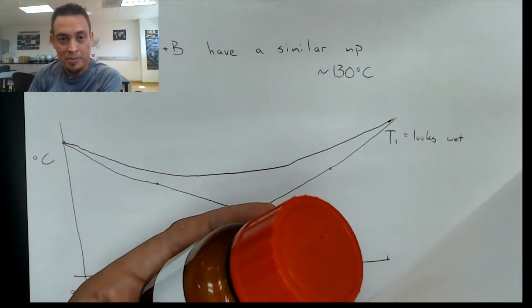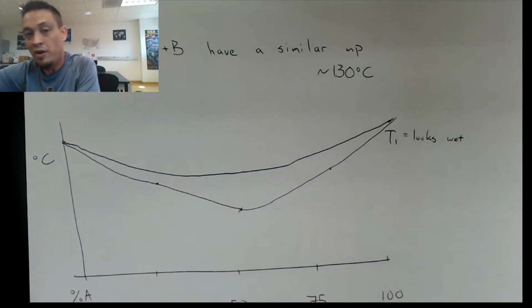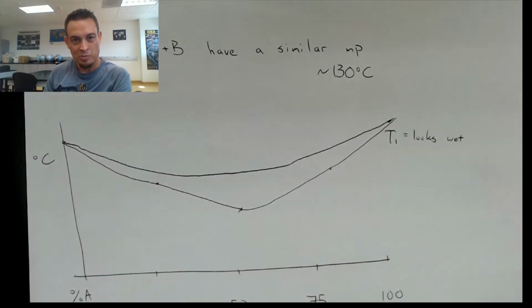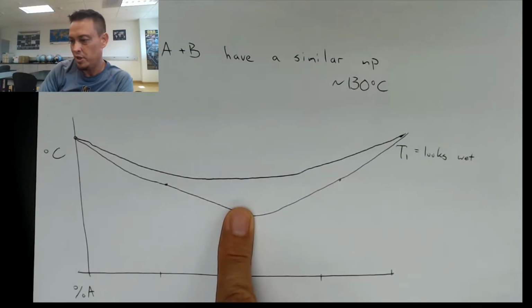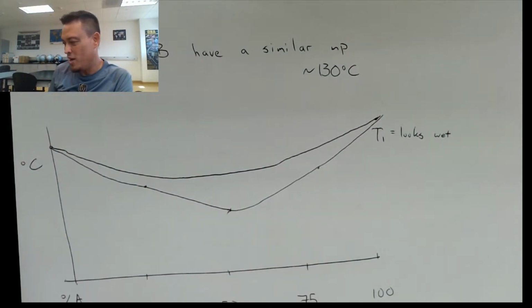They melt at about 133 degrees. However, if you mix them together, the melting point changes. So we can simultaneously illustrate in part A that you can see the broadening as it becomes more impure. And then you could also potentially use this as a way to determine the identity of an unknown.